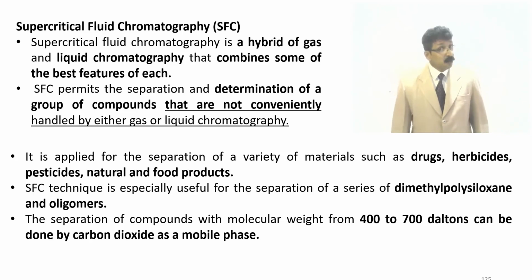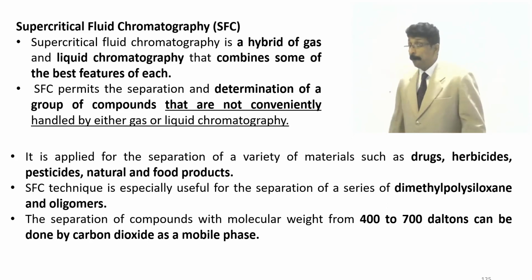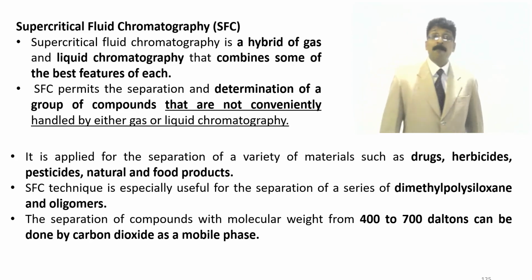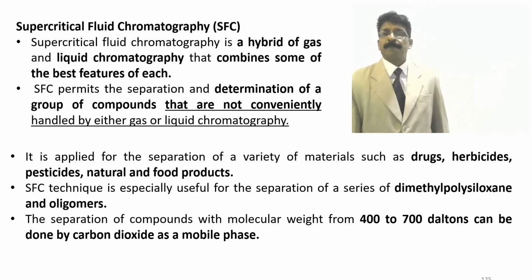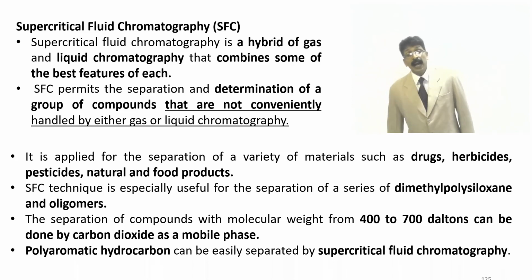You know that in supercritical fluid chromatography, the major mobile phase is carbon dioxide, the liquid carbon dioxide. And we can even use it for polyaromatic hydrocarbons.